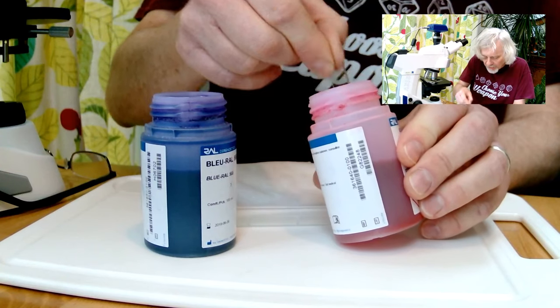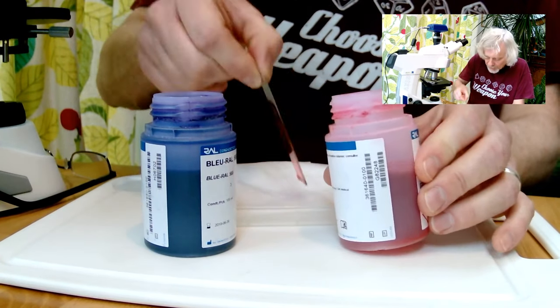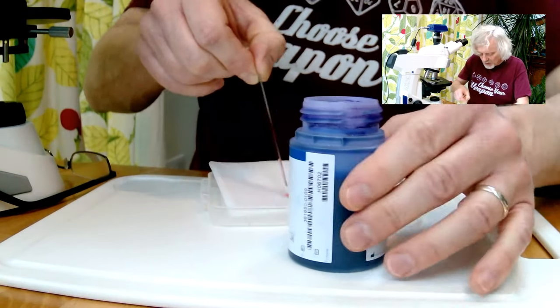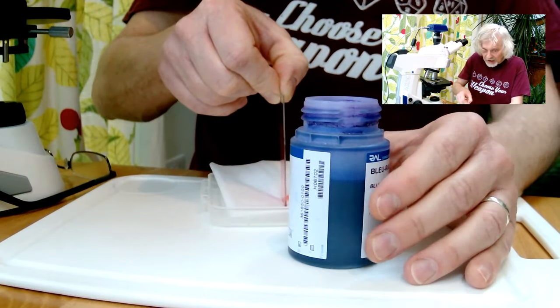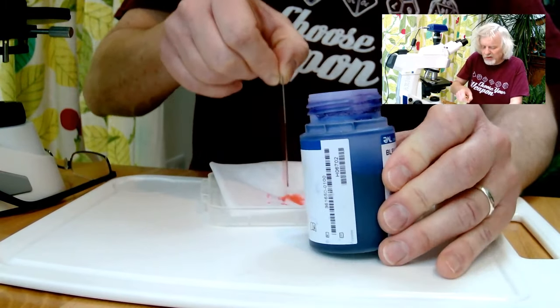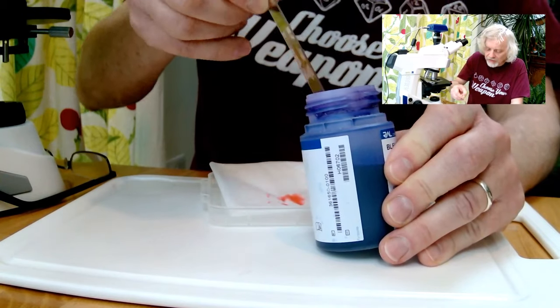Five. Okay, that one's eosin. That one goes in. Get rid of that. Don't want to drop these, spill them in a horrible mess on the kitchen table. And lastly, this one. This one's a bit like a chemical called toluidine blue. It's not actually toluidine blue, but it's close enough.